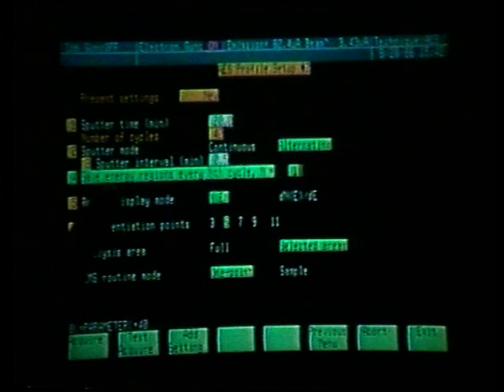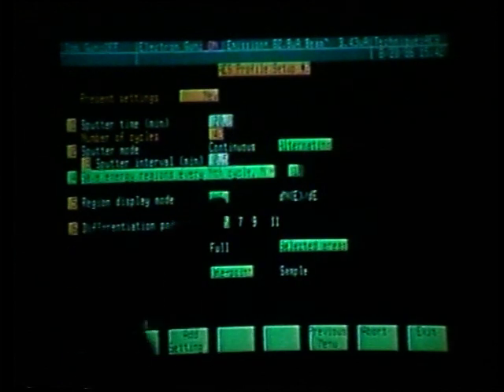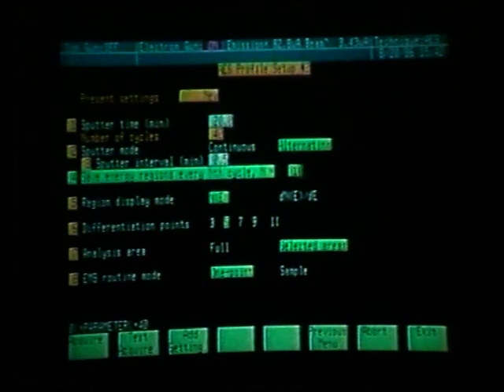If we change the every nth cycle to 5, what we will then do is have an energy region that we can call up and look at the peak itself, the peak shape, for, again, only a window profile. We can call up that energy window for the 5th cycle, the 10th cycle, the 15th cycle, the 20th cycle, and so forth, out to 100 cycles.